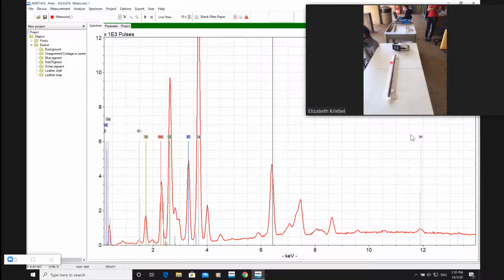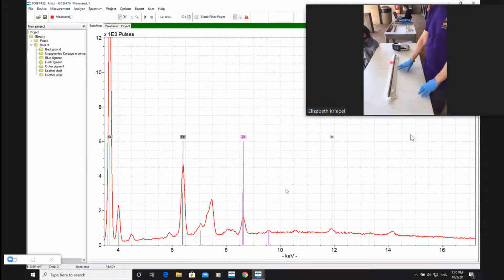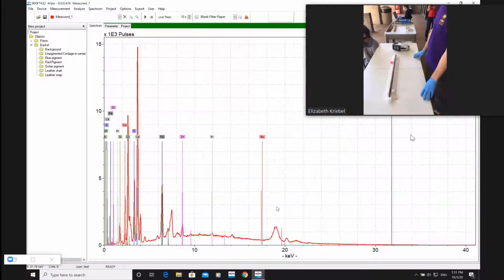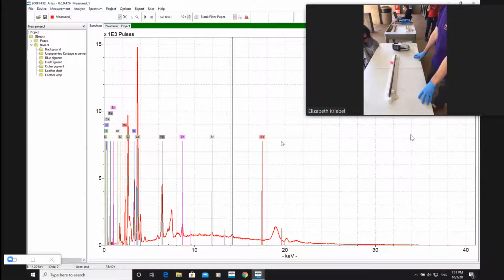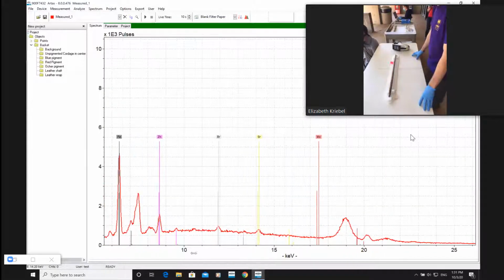A lot of iron. Wow, that seems kind of unexpected. A lot of zinc. That's a surprising variety in what appears to be simply a chunk of wood. Yes, it is. A little bit of lead too. I may play the host of all those archaeology shows that plays like they don't know anything. In this case, I don't actually know anything. It feels like a surprising amount of stuff to be in this stick.